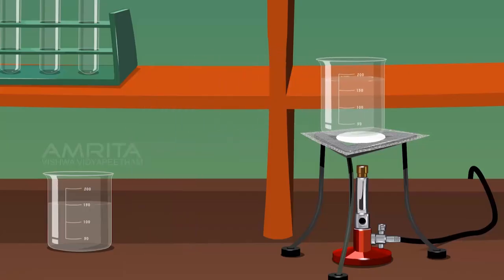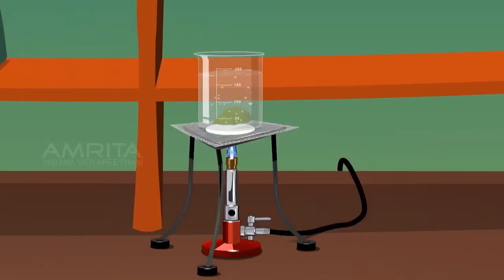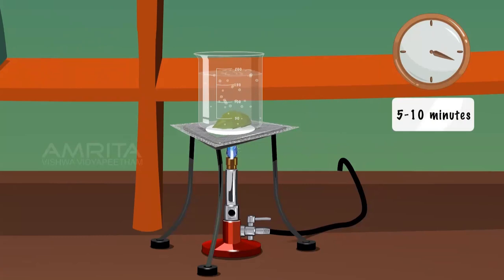Take a beaker containing distilled water, place it over a Bunsen burner and boil it. Put the experimental leaf into the boiling water and boil for 5-10 minutes till the leaf becomes soft.